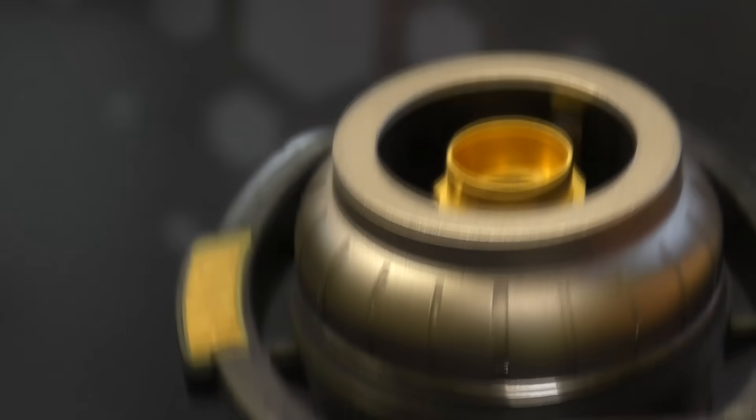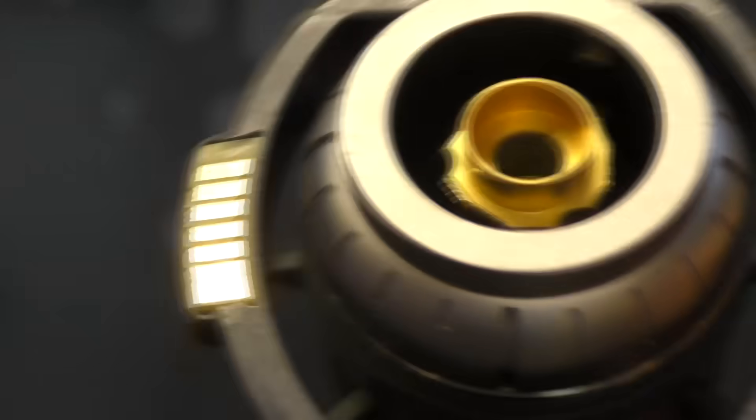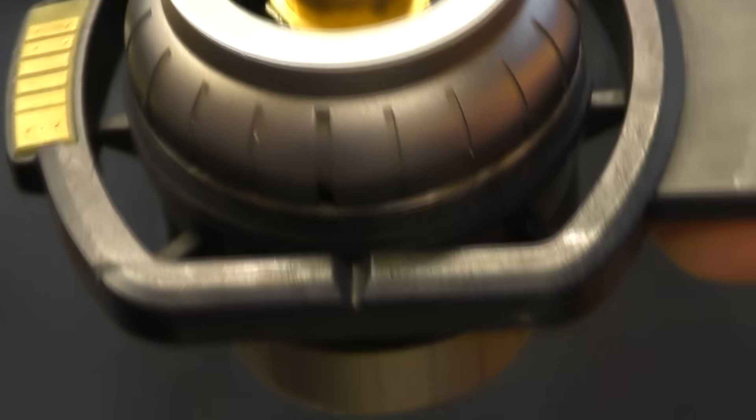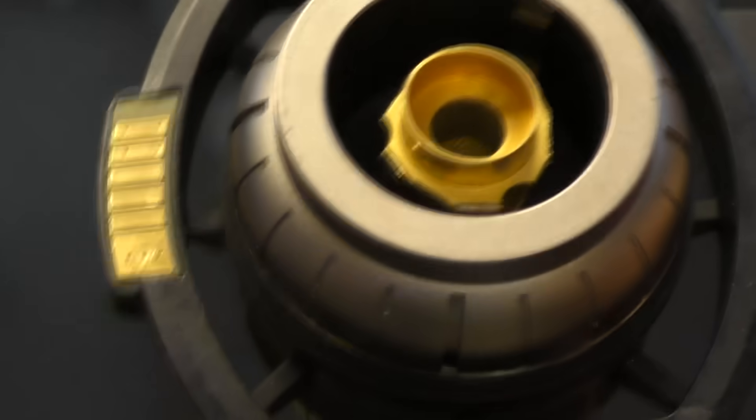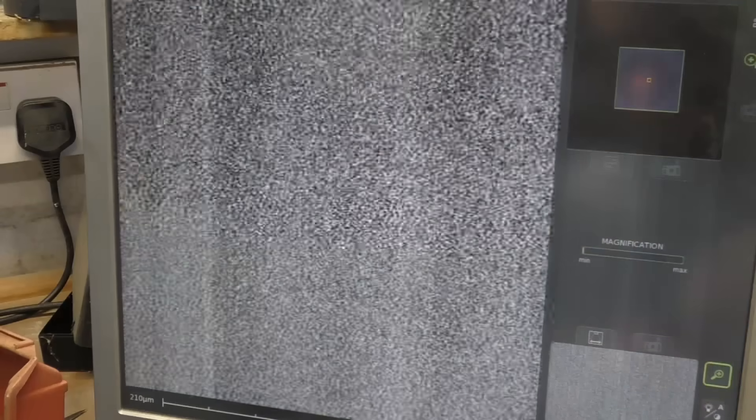Because that's presumably going to be spitting electrons out that may be detectable by the detector. Let's see what happens if we stick this in. It doesn't seem to be detecting anything, but it may just be because it's not strong enough.